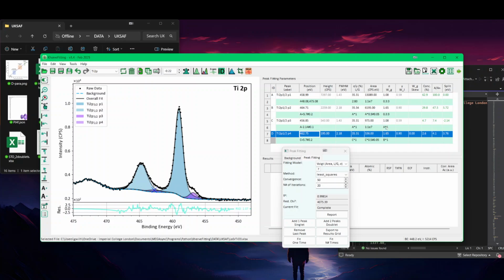And you can do the same for the area. So let's say the area will also be in function of A, and the ratio between A and C is given here, 7.4. So if I type A, it will know, and it will take these values here.